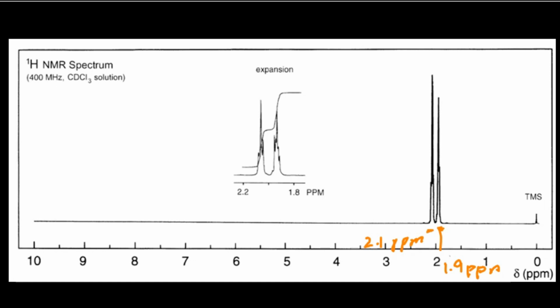If you see here, some kind of triplet is present, and here also, so it means the hydrogen that is present here is attached to two more hydrogens in its neighboring carbons. We get this information by following the n plus 1 rule. The n tells you the number of hydrogens present in the neighboring, and the 1 is the hydrogen that we are considering. The n plus 1 rule tells you that you are getting the triplet. So I am writing here the triplet.